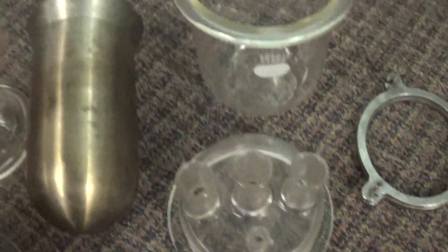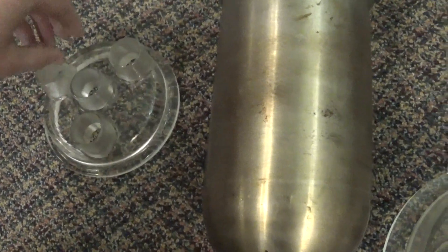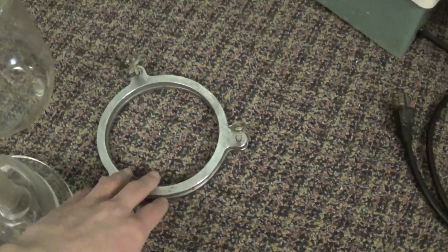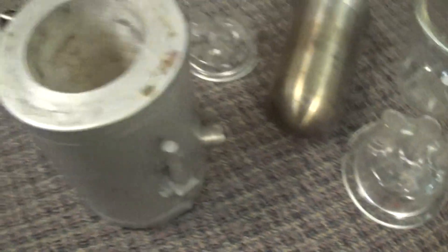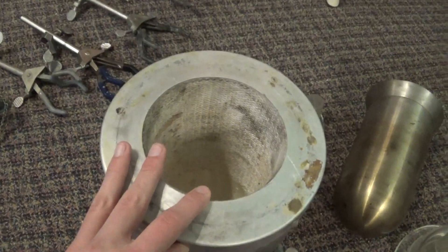It's probably for a thermometer. And then one which has four 24/29 joints on it, but that should work fine with 24/40. Also a clamp for the vessel lids, and this huge 2-liter glass coil heating mantle.